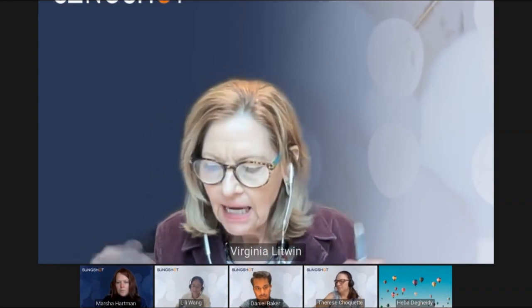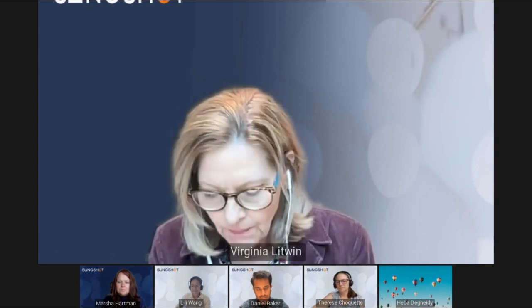Great, thanks. And thank you, Therese, for a really good presentation. You touched upon so many critical things. So I don't know where to begin, but just circling back to what Daniel was saying. And in CLSI H62, we address the basic approach that you would use for flow cytometry. And Therese picked up on the points, and she's sort of new to this document. So I'm really pleased to hear that it sort of validates what we wrote in there.